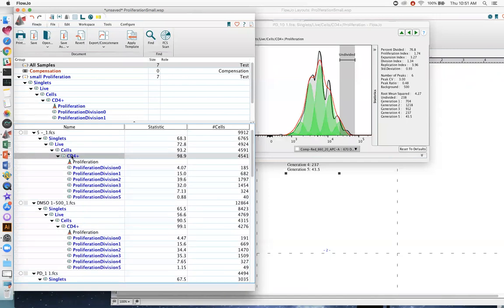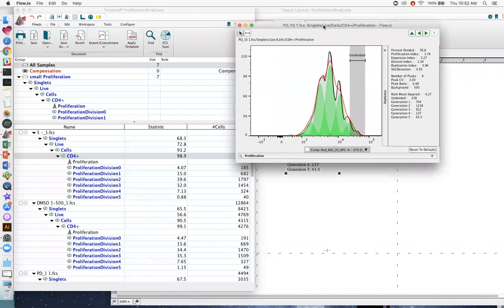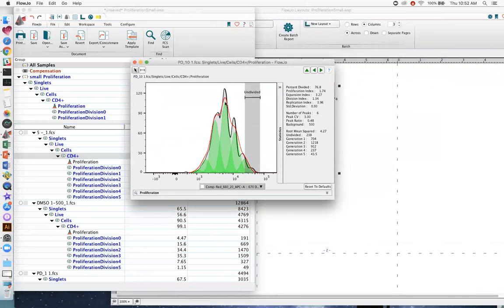to be working with. So in my case, CD4s make up a large percentage of the total data, right? So I have 4,500 CD4 cells here, which are roughly half of what we have in total. So I'm going to tell you that the minimum you want to put into this model is right around 5,000 cells. If you have less than 5,000, you'll start to see these histograms have rectangular edges. And when you see models with rectangular edges, then you're out of the ballpark there.